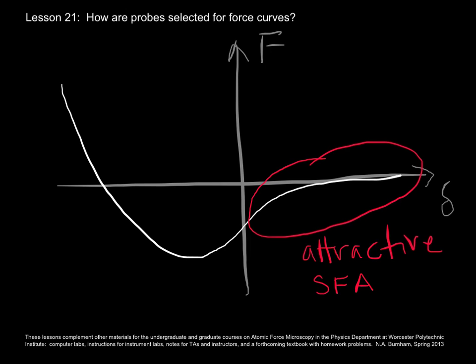In that, you take two mica-coated cylinders of about a centimeter in diameter, and you bring them together and apart, much like a force curve in AFM. For the most part, that was to study, as the name suggests, surface forces, and the point was not to indent, although occasionally you would study the deformed shape of those mica cylinders when the surfaces came into contact.